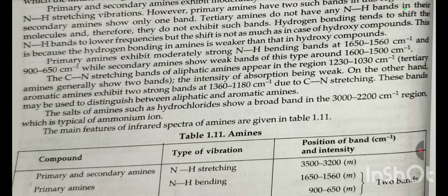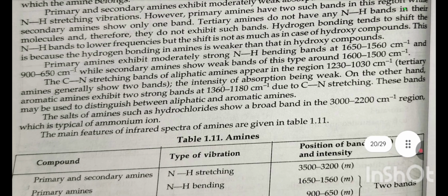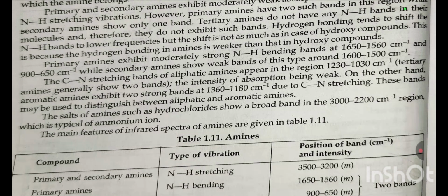Hydrogen bonding tends to shift the NH band to lower frequencies, but the shift is not as much as in the case of hydroxy compounds. This is because the hydrogen bonding in amines is weaker than that in hydroxy compounds.